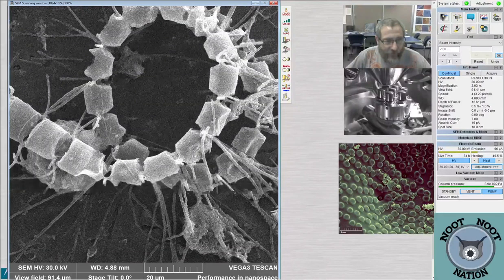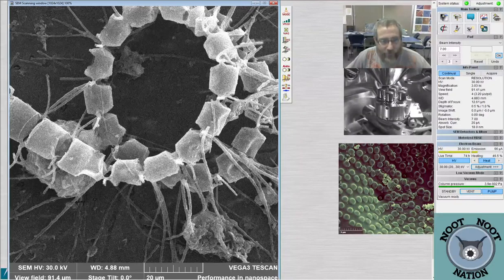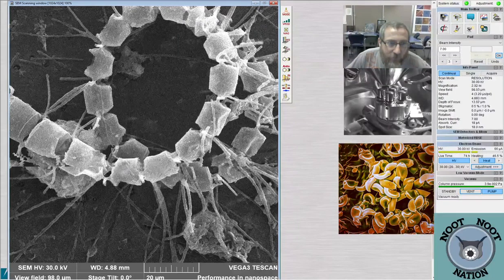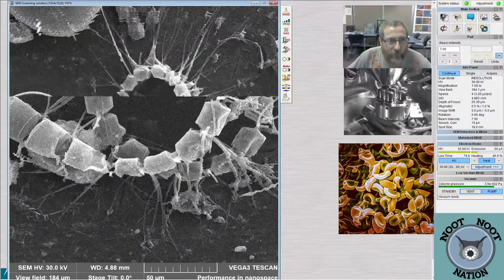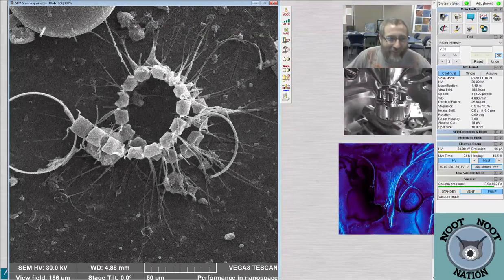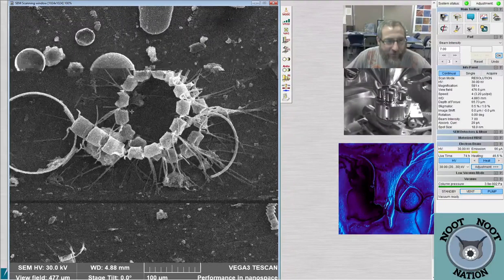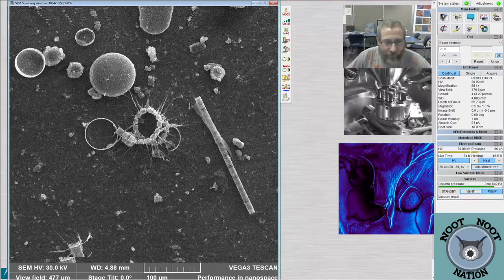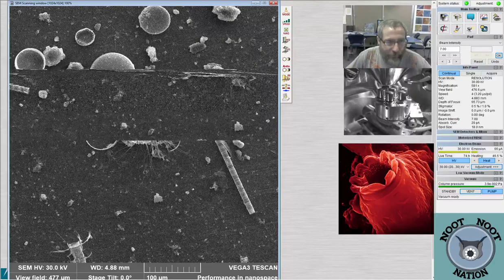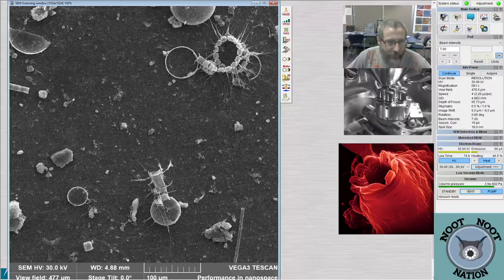Yeah, and this is another one of those, I don't know what you're calling it, debilis or something. You can see the whole coil is here, and it's actually going around a couple of times. Yeah, debilis, D-E-B-I-L-I-S. I spelled that one. Well, nice. It looks like a little centipede, right? It's got a kind of a coil to it. And then this is Skeletonema, which is really common in these samples. Here's another big catastrophe of some type.